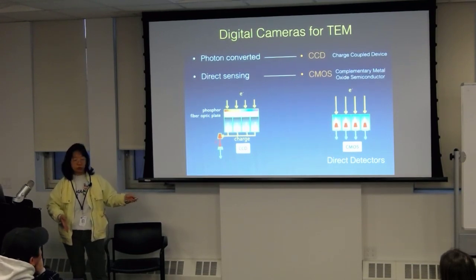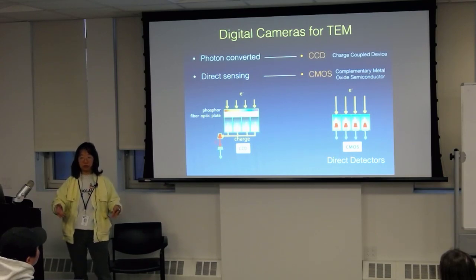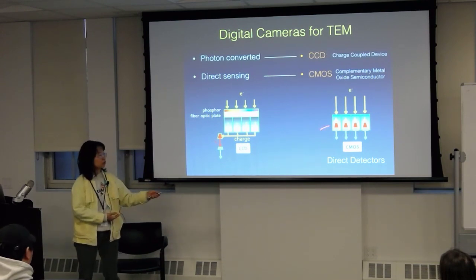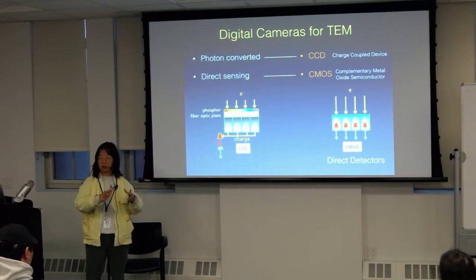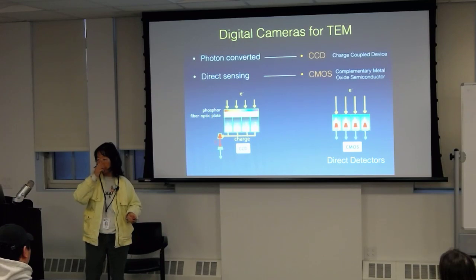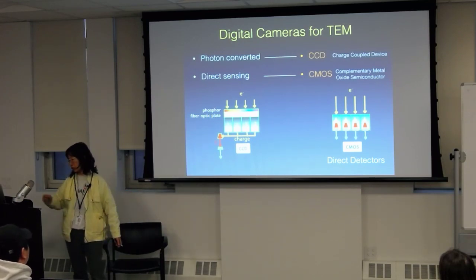As a result, when we're using a CMOS camera, we get what they call a frame, and you can get really high frame rates because each time you can read out the whole chip really fast. On the CCD, it's more limited. That's basically changed how we do things nowadays.